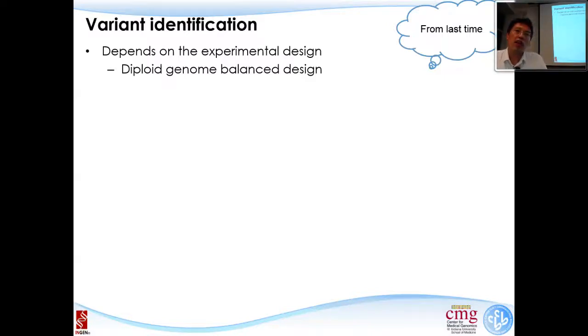If there is any variant, you will have the reference and alternative: homozygous reference, which is not a variant, or heterozygous, which means the 2 alleles are different, or homozygous variant, where both your father and mother alleles are different from the reference genome. So it's either 0%, 50%, or 100%.